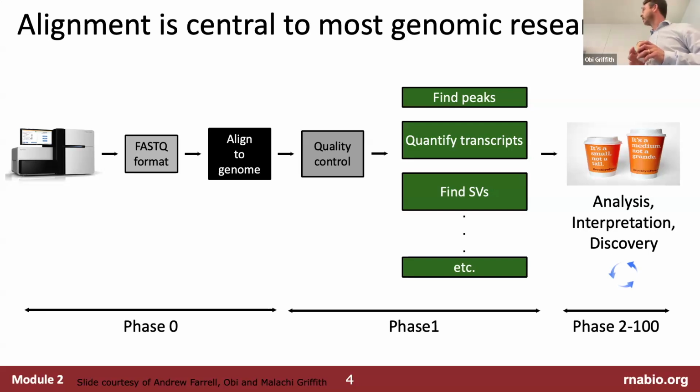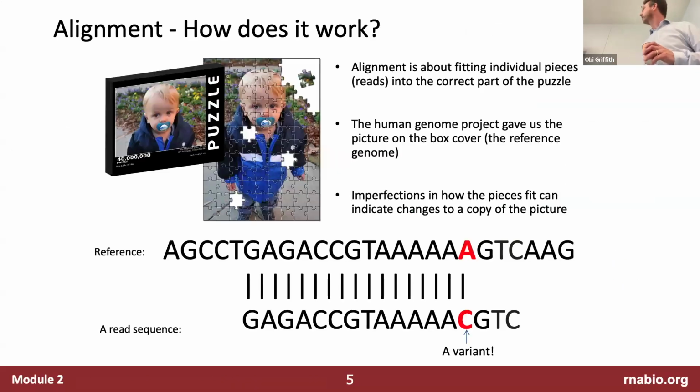Okay, so there's this secondary phase of doing things like finding peaks and quantifying transcripts. And then there's this endless iterative phase of ad hoc analysis and interpretation and discovery and visualization. But it all starts with alignment.